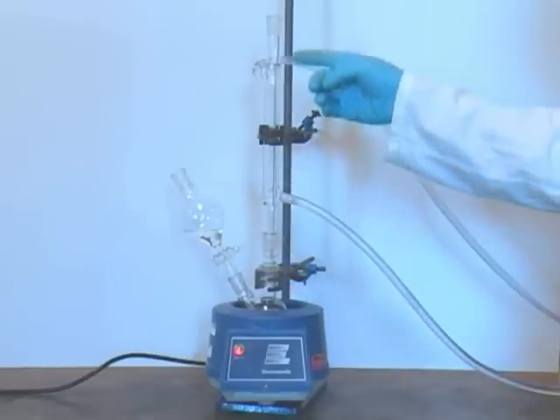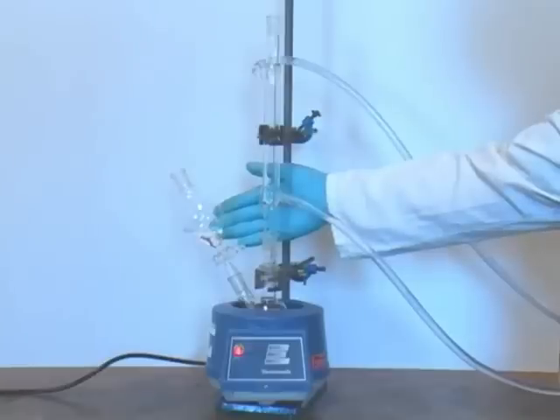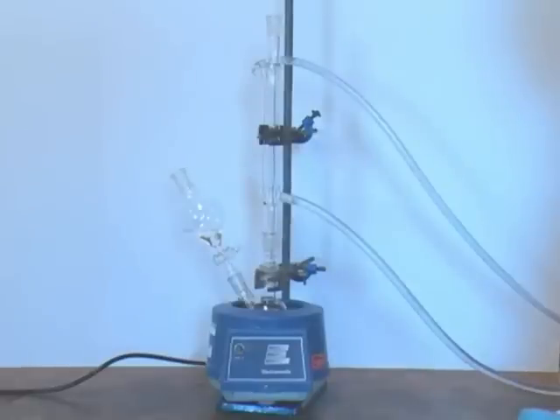Above our reaction flask, we have a condenser in an upright position. In the other neck of the flask, we have a dropping funnel which contains the solution of the other reagent we need to add to the reaction mixture. Remember that water always goes into condensers at the bottom and comes out at the top.